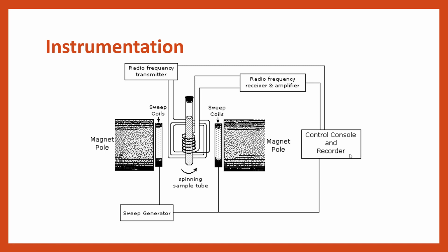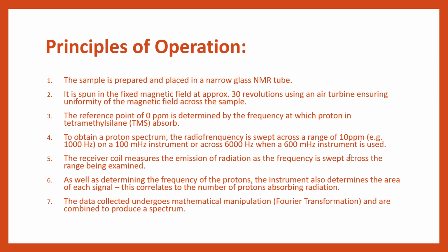And obviously, this is all computerized, and the raw data from the instrument undergoes further transformation, and we can then see it as a proper graph, okay? So what would we actually do? If we were going to use the instrument, how would it work?